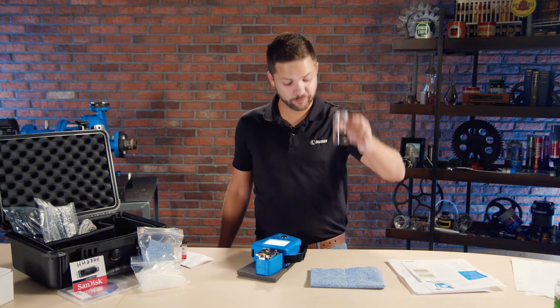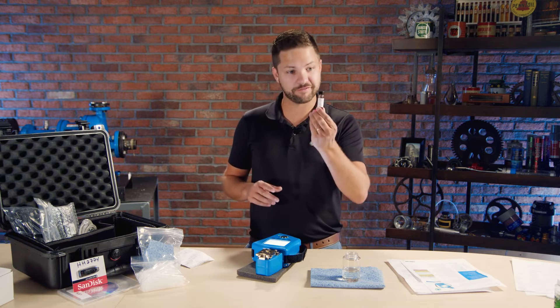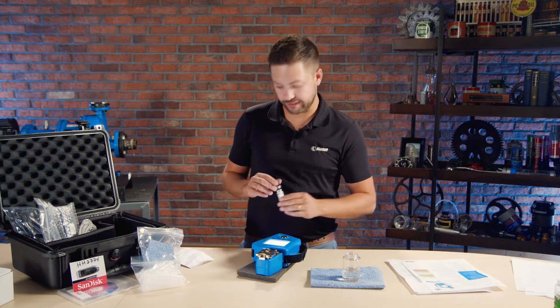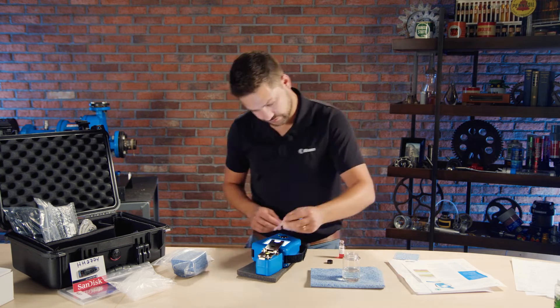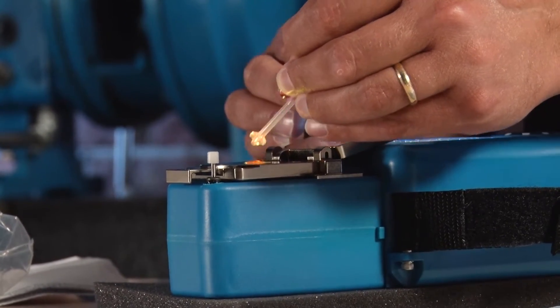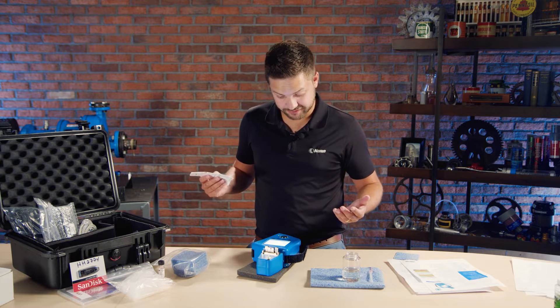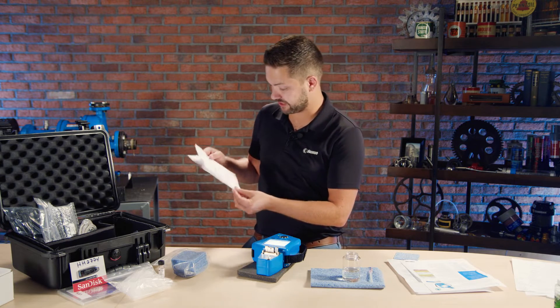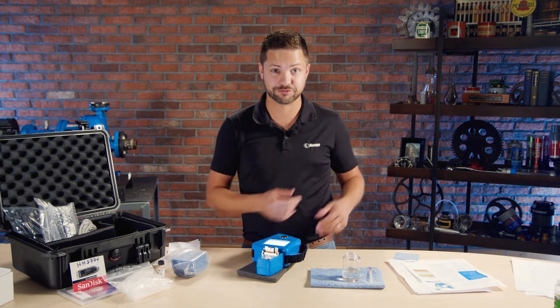I got an oil here and I'm about to test it. But as I was getting started, I realized one of the steps was simply to use the check fluid they provided to do a reference check and make sure everything's looking correct. As I'm waiting for it to finish — it's right at 35% — I'm looking at the reference fluid. They provide a certificate of analysis for the infrared check fluid, and it's already 50% done. Like I said, it takes a couple of minutes.